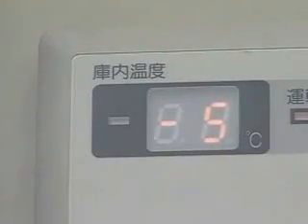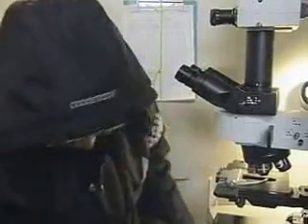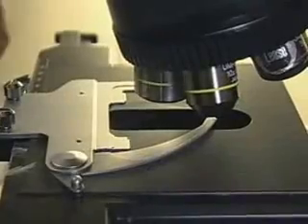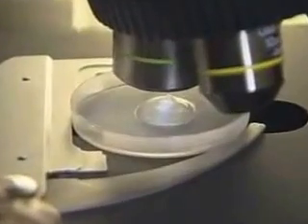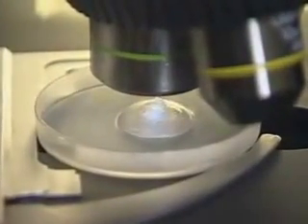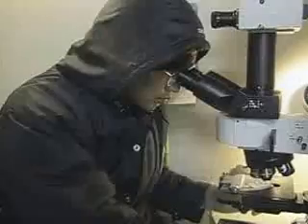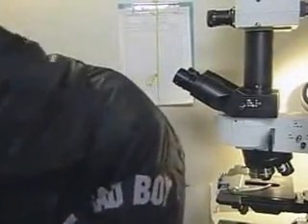The crystals are then examined inside our laboratory, where the temperature remains at a constant -5 degrees centigrade. 3 hours later, we examine the tip of each ice block by illuminating it under a microscope. The crystals start to grow and expand as the temperature of the ice tip rises under the microscope.